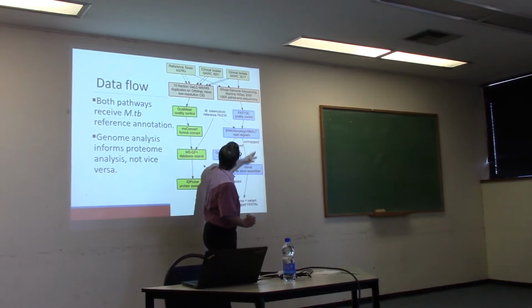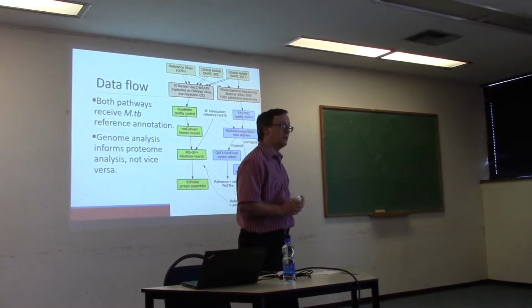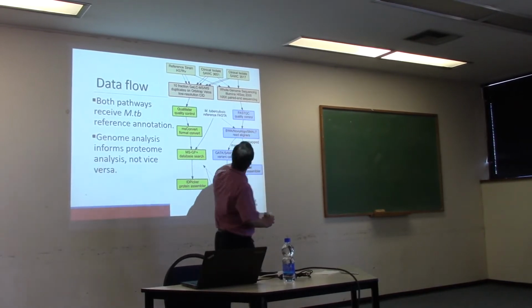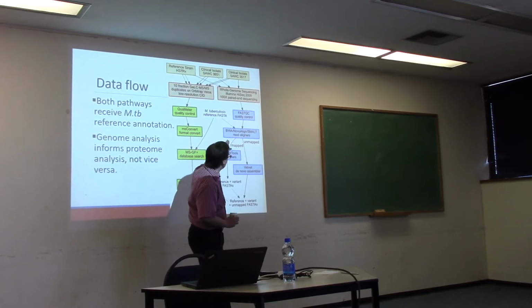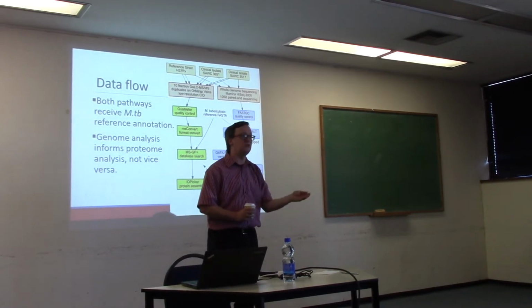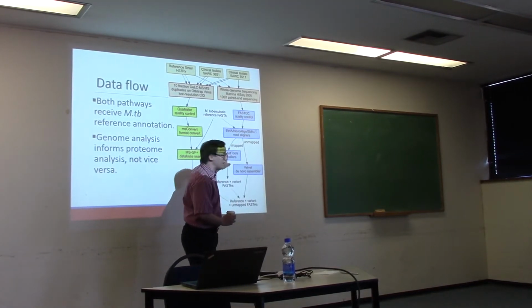Over on the genomic side, every project should start with quality control, and that's true for sequencing as well. We used FastQC to evaluate the sequence read quality. Pretty good stuff. I've left out a step here, trimming off the bits of sequence that are not actually helpful. We had read aligners, so we needed to be able to see where within the MTB genome these reads fit. And that gave us sections of sequence that were aligned successfully and may have contained variants which needed to be called out by different algorithms.